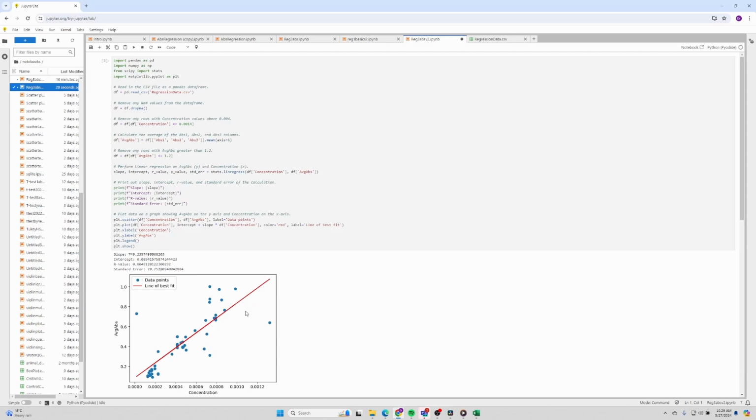And we see that the best fit is better. There's a couple of values here that are still off. Again, it looks like this absorbance value is supposed to be here, so that someone wrote in something that was wrong. In fact, the concentration of this is so low that it's not possible that an absorbance value this strong would come from a concentration that was almost zero. So obviously someone put in the value wrong. So there's one more that we could potentially get rid of here.